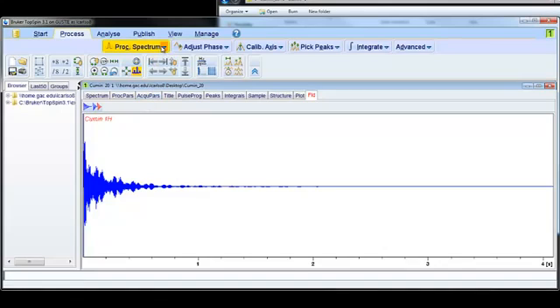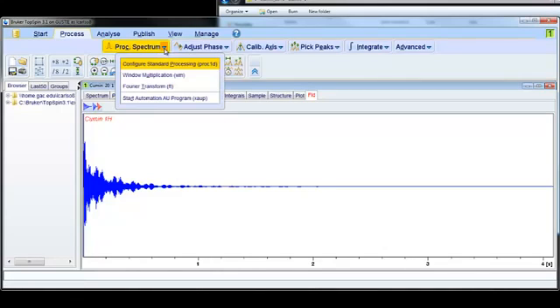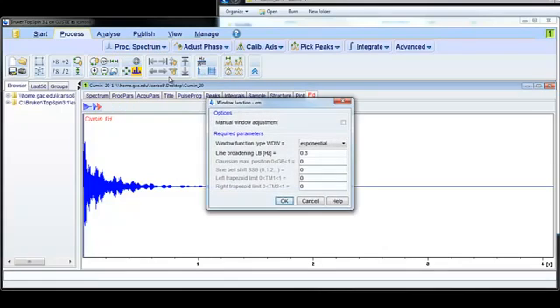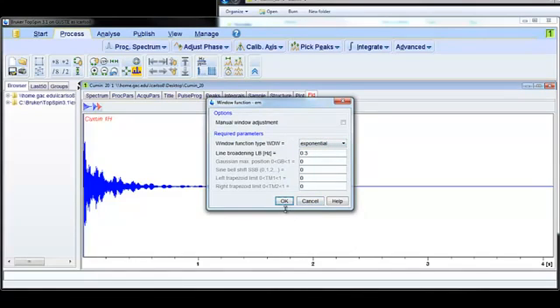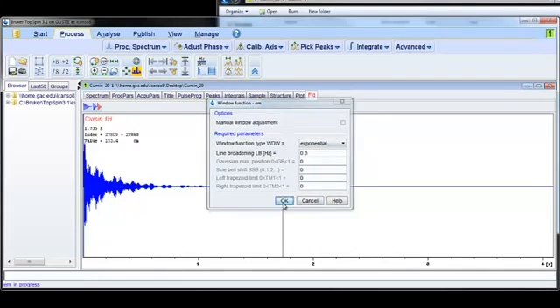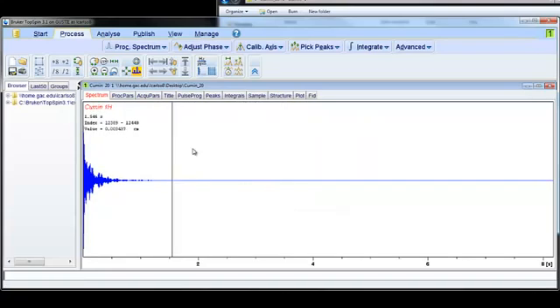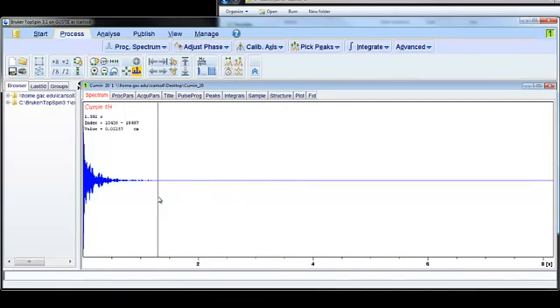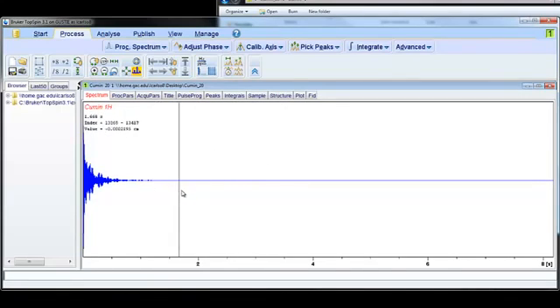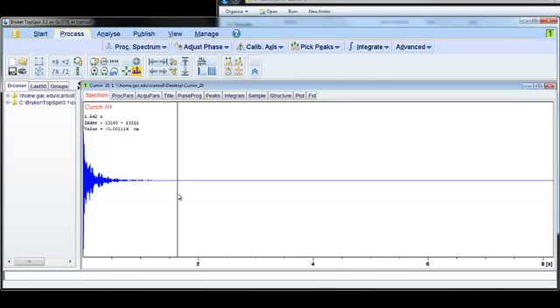So if I click on this down arrow under Process Spectrum, and click Window Multiplication, this is already set up to do exponential multiplication. So I'll just click OK, and you can see that a lot of these points that were out here are now gone. It's important to know that although this process is important and it does improve the signal-to-noise ratio, it actually does also decrease the resolution of your spectrum a little bit. So it's important to know that tradeoff.